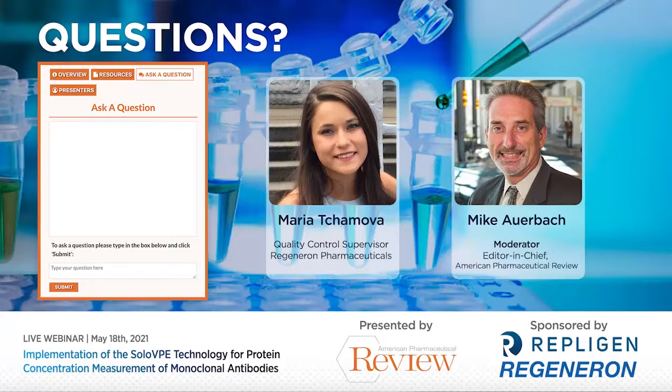To answer the other question that came up as far as additional extinction coefficients, certainly the device is already being used for multiple gene therapy applications, such as oligonucleotides, plasmid purity, empty full analysis for AAV material, which all have very different extinction coefficients compared to a protein.